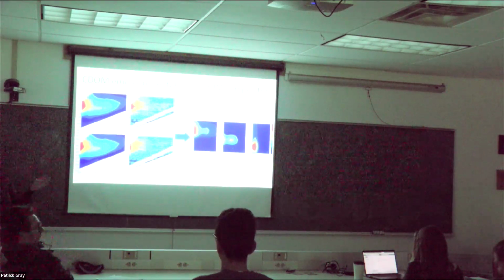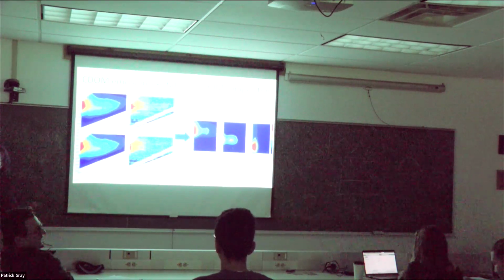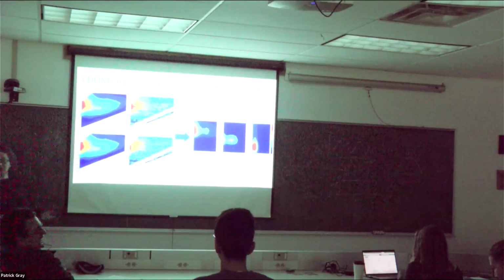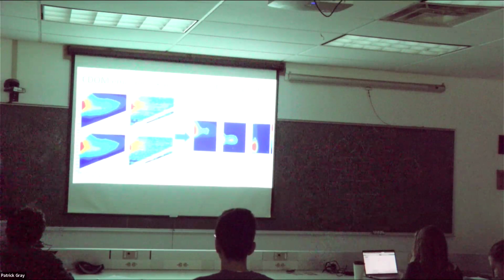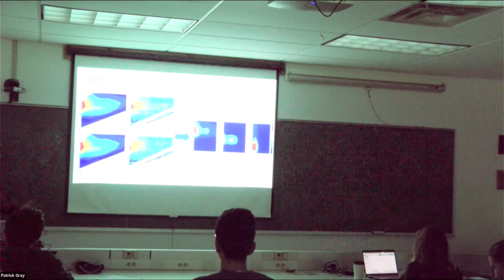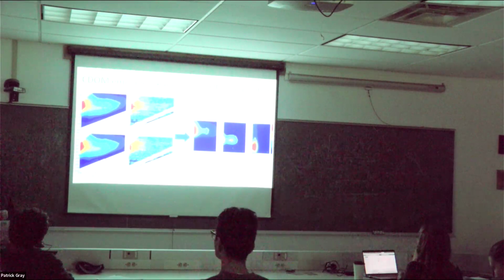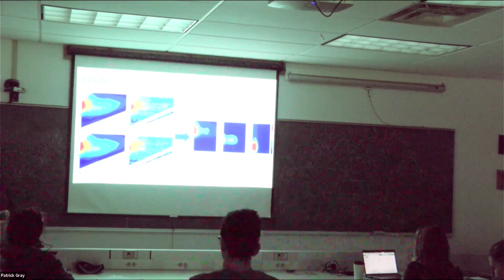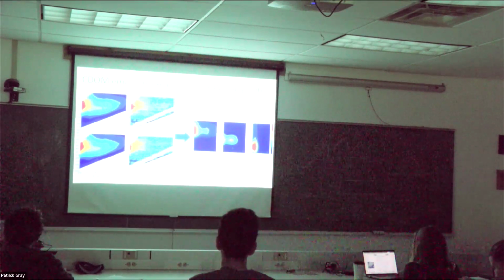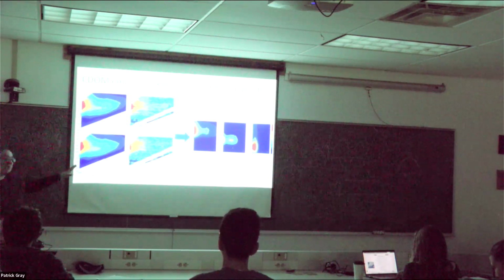Meg, am I going in a generally good direction here? Ish. But you can, for example, use this to observe processes, like change of the CDOM due to pH, due to photooxidation, or due to different processes, digestion by bacteria, and so on. So why? I'm not sure. I'm not a CDOM person, that's why I'm not going too deep. But this is definitely a question you can take to Meg. Am I saying anything terribly wrong? Okay, great. Yeah, I just took the paper because I liked it, because it has an autonomous version.